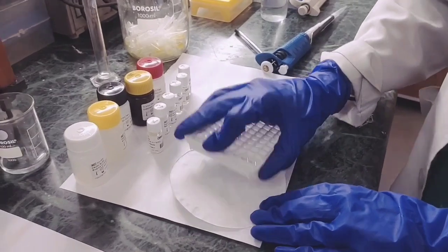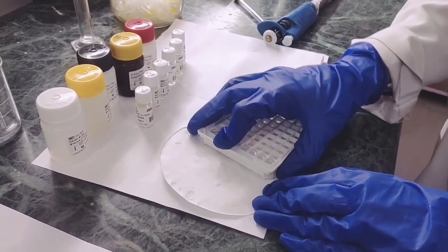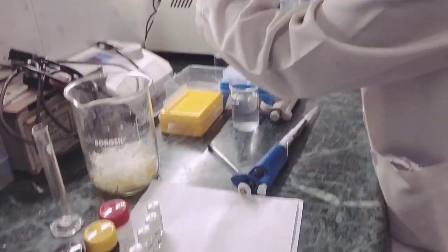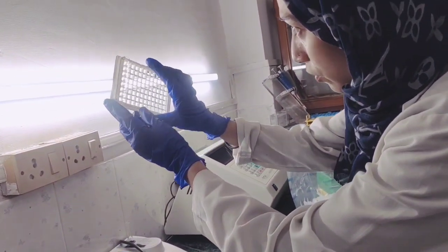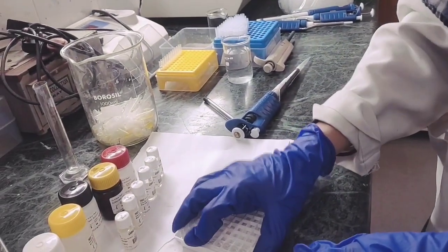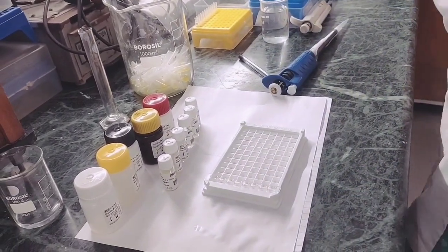We'll tap the plate on absorbing paper or filter paper to remove any droplets. We'll make sure that there are no droplets of wash solution left in the microtiter well. Then we'll proceed with the next step.